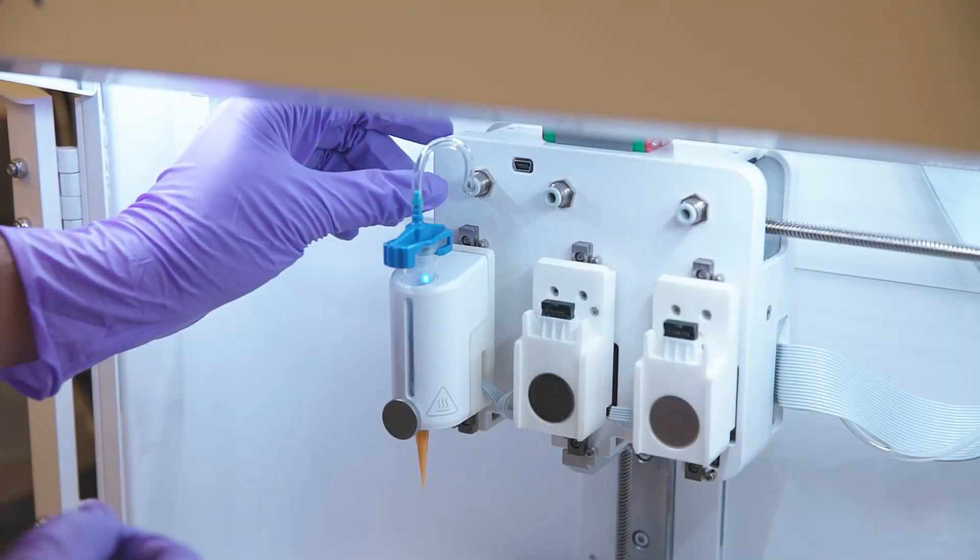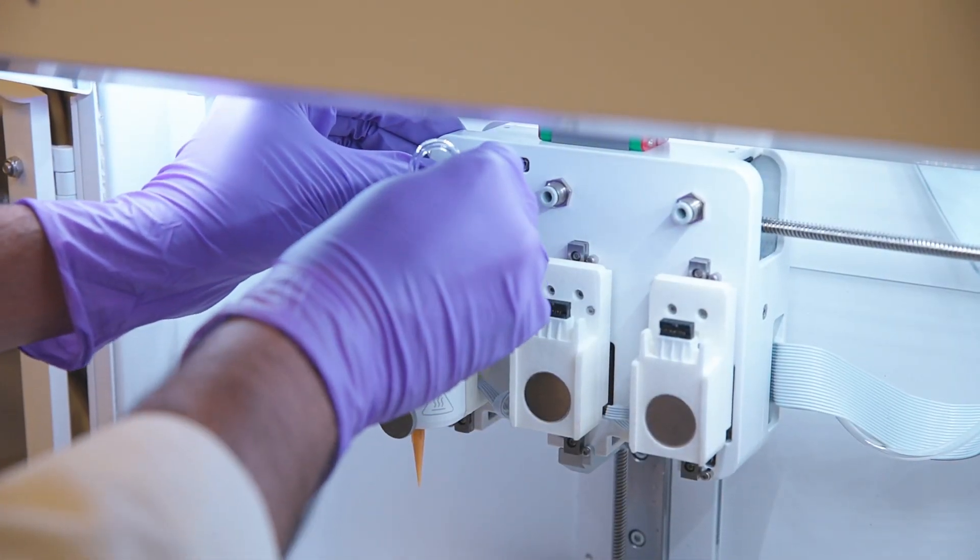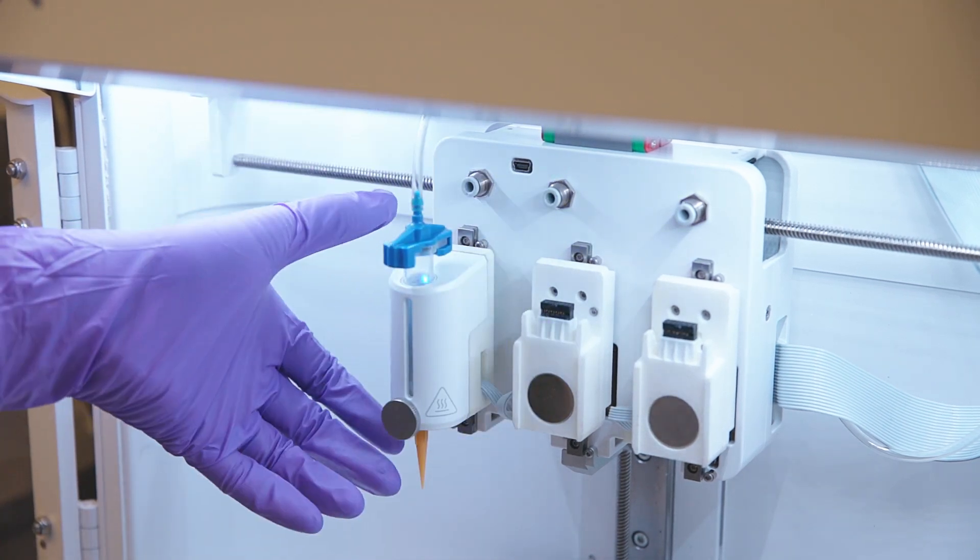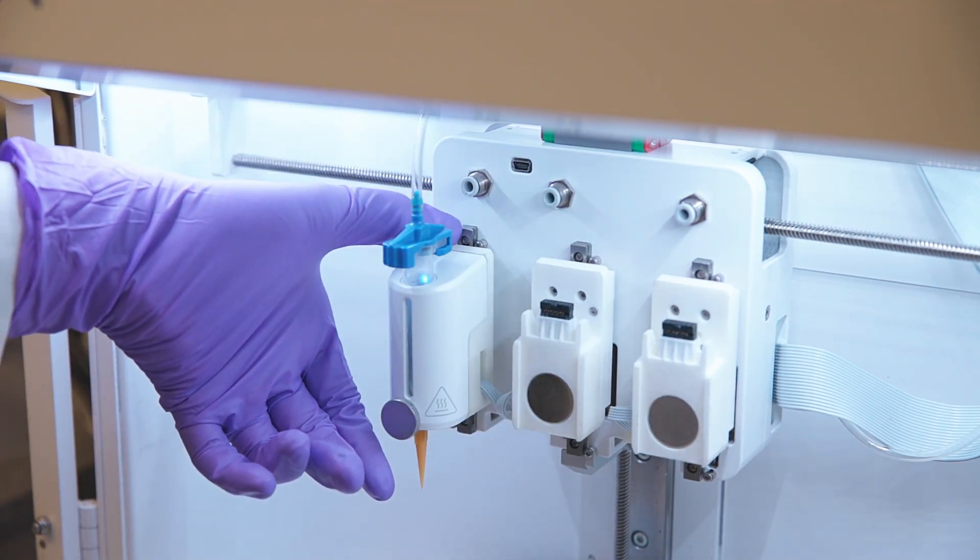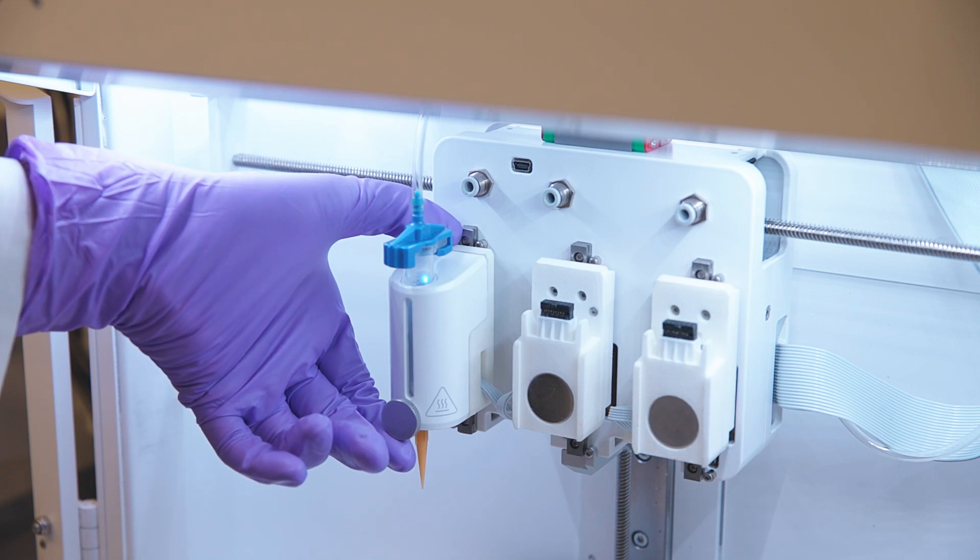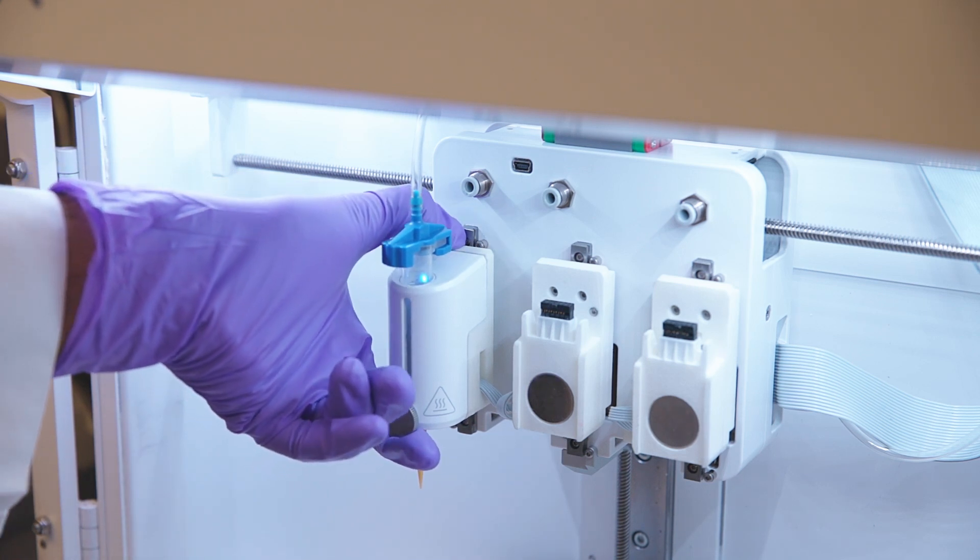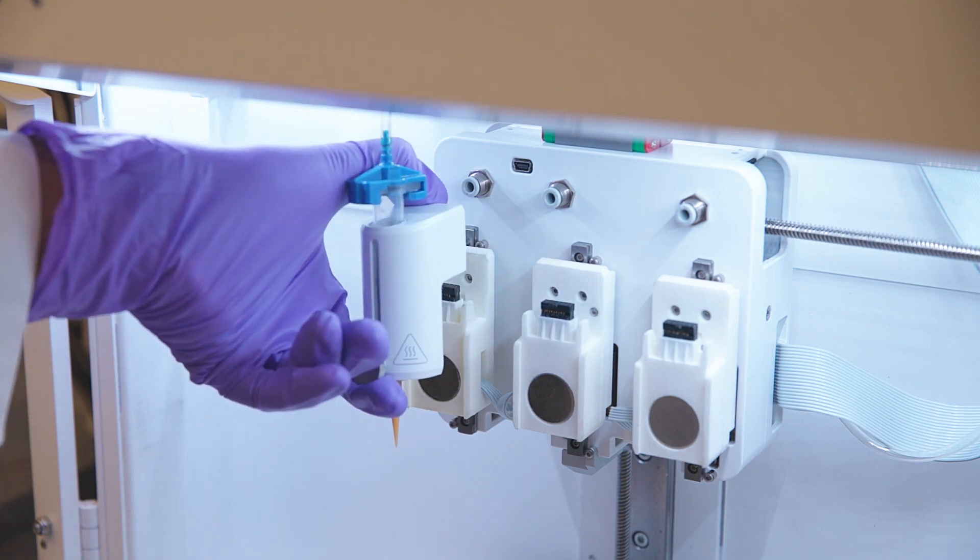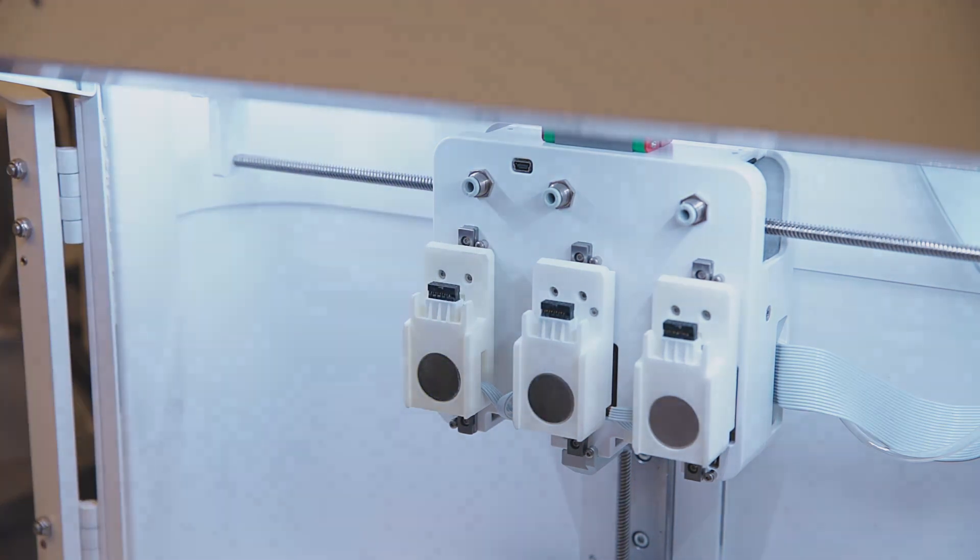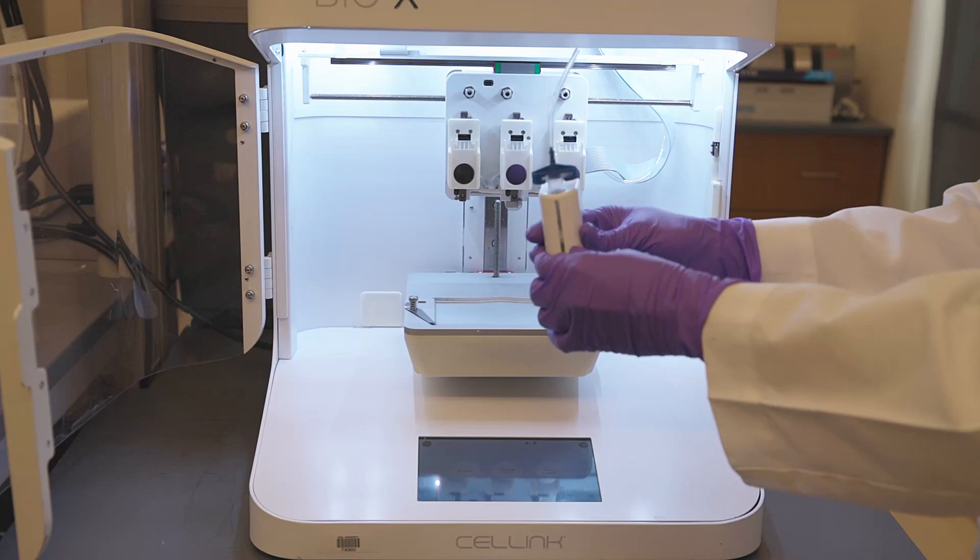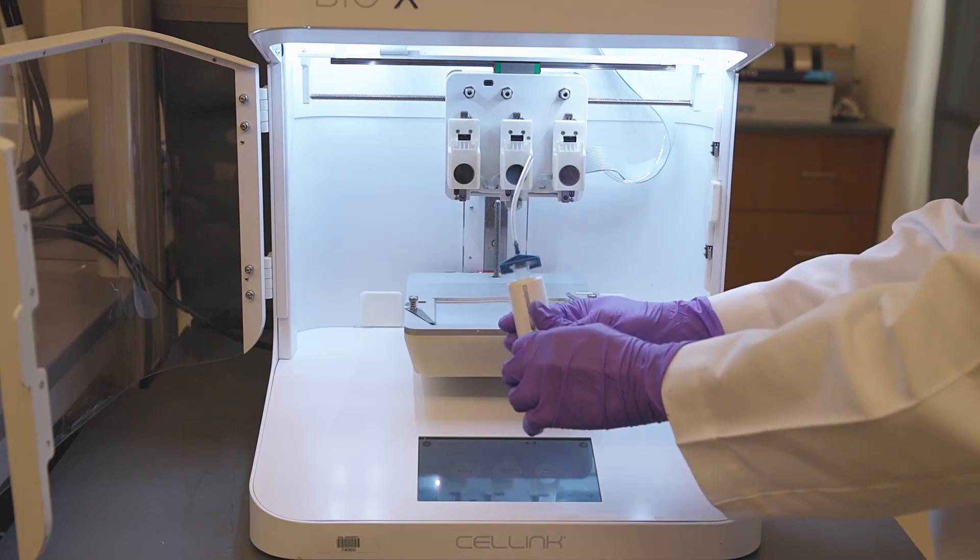To remove the mounted printhead, first disconnect the air compressor line by pushing this grey flap and gently pulling the line. Next, gently pull the printhead upwards by pressing on the back and holding the printhead in the front. Unscrew the screw in the front to remove the cartridge.